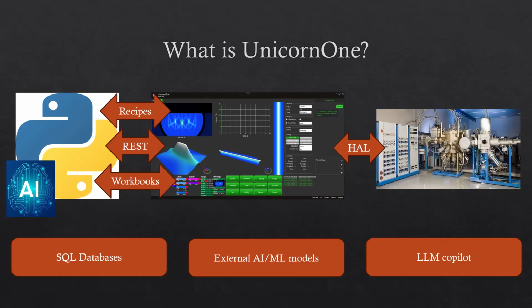Traditional laboratory software is normally built around individual pieces of equipment. A custom LabVIEW application, Python application, or vendor control package can be extremely effective at controlling the system it was designed for. But as the laboratory grows, those applications become islands. Every new instrument introduces another hardware interface, another data format, and another integration problem.